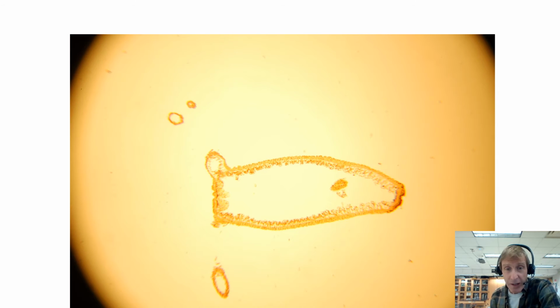It's a sort of longitudinal section. So you'll see the gastrovascular cavity here. You can see the mouth would have been up at this end somewhere, coming through here. You'll see the mesoglea is very thin right about there. So you've got an outer layer of the epidermis, and you've got the inner layer, which is the gastrodermis.